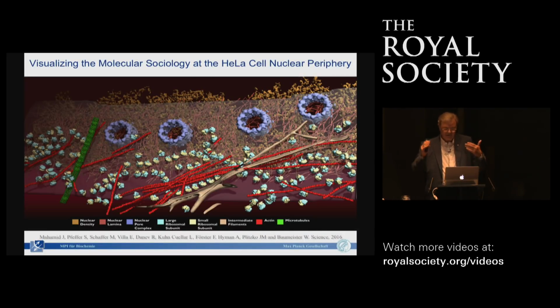So that is basically a summary here. Again, you see in the background the heterochromatin, then you see the fine meshwork in reddish orange color of the nuclear lamina, and on the outer surface, you see the polysome sitting.